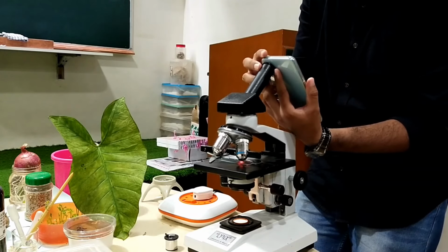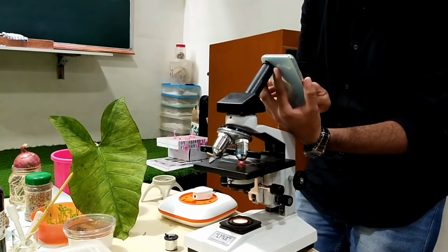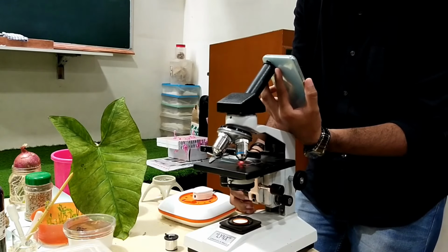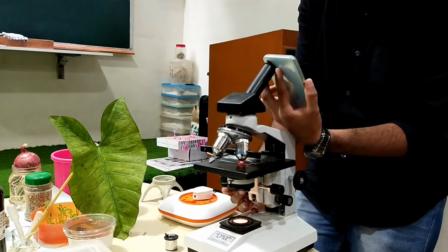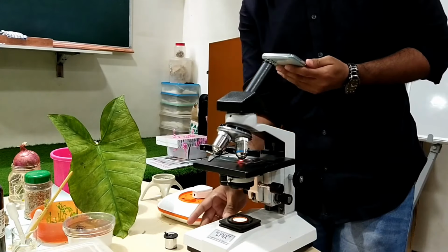I've adjusted this, so you can make the zoom with the help of the microscope plus the camera. Yes, I found a great spot. I'll focus a little bit, using the fine adjustment, and after I focused it well, I've clicked a couple of pictures. I've got a couple of beautiful pictures, and I'll be showing them to you now.